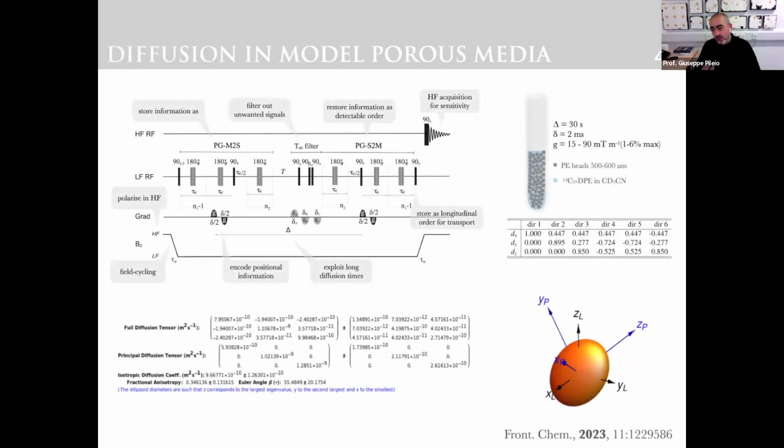The purpose of all this, obviously, is now to get access to the diffusion in 3D. So you need these 3D capabilities, which are actually unique. There are many shuttles in the world, but this is the only shuttle which can do that, which retains radio frequencies but also 3-axis gradients in low field. And here is just an example of how we measure the diffusion in 6 different directions.